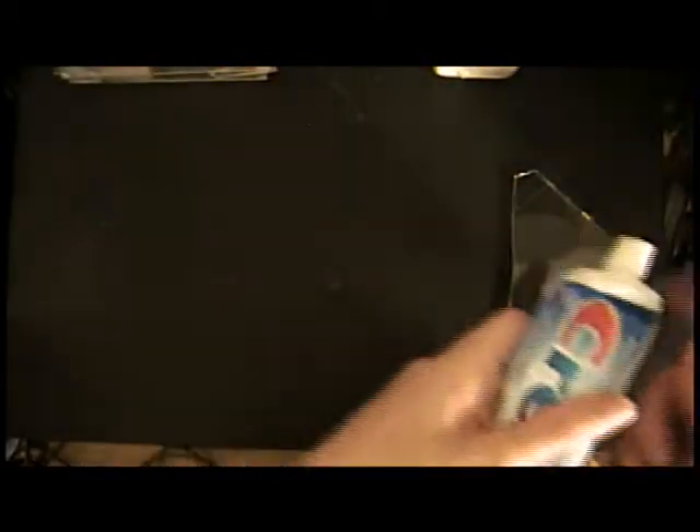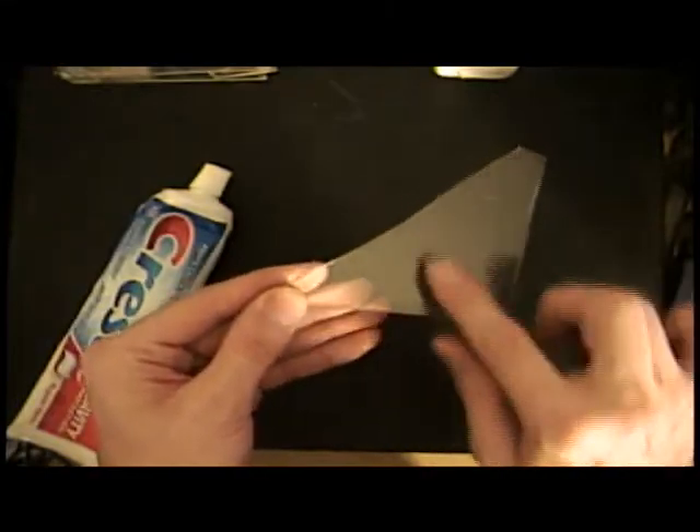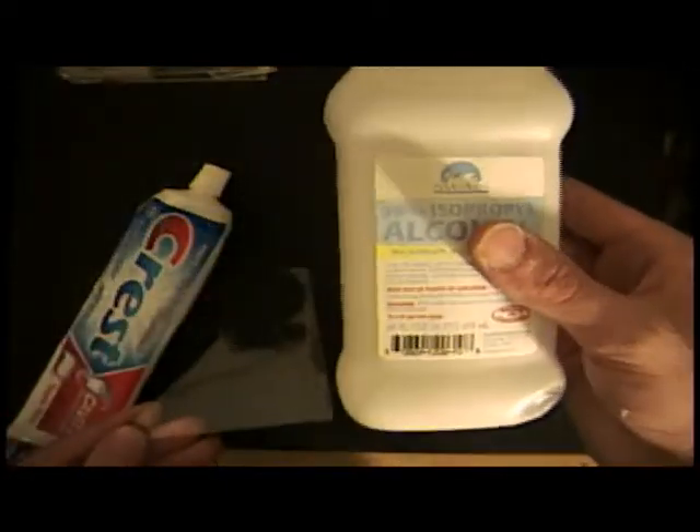What you'll want to do is take the toothpaste and lightly scrub it against the glass — since it's abrasive, it will rough up the surface slightly for the tin oxide to stick. Then you'll rinse it under water, soapy water, and wash it off with alcohol.